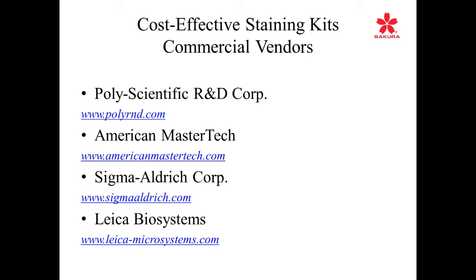If you're a laboratory that is only doing like 1 or 2 stains a week, very seldom, it's not really cost-effective for you to invest in huge automation, even with the expense of the instrument, the expense of the reagents and the kits, and you're not running that much.